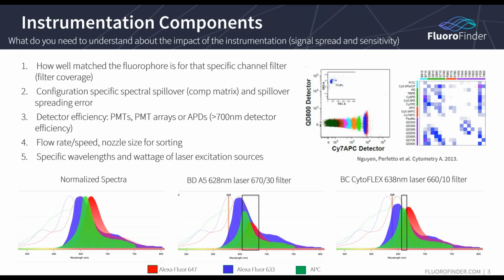One of the elements of instrumentation that I want to make sure you have clarified is that within every configuration, every instrument that you have, you're going to have a different amount of spectral spillover into each channel, as you've probably known previously by simply having a compensation matrix.